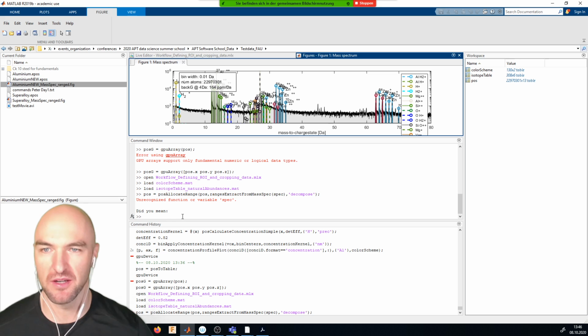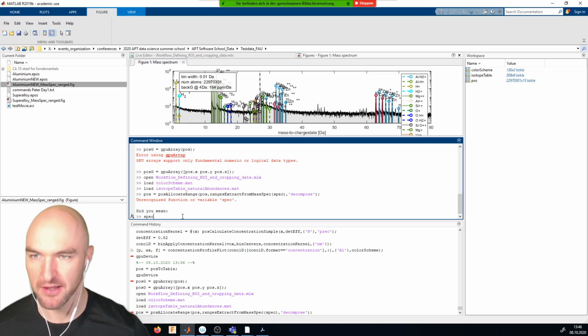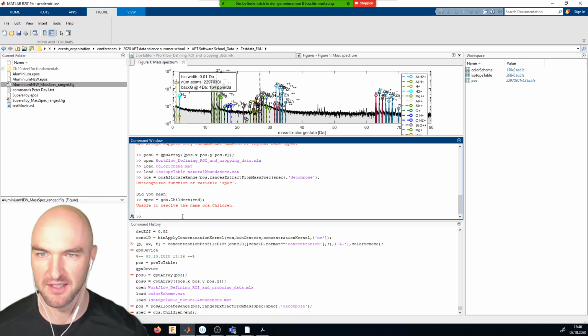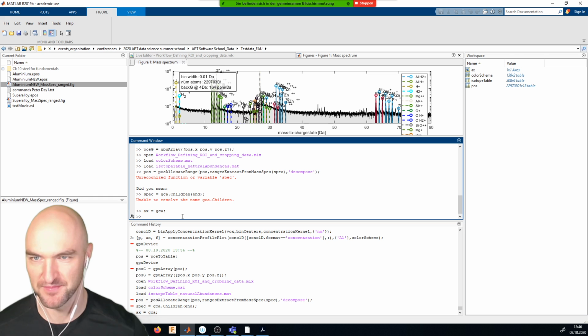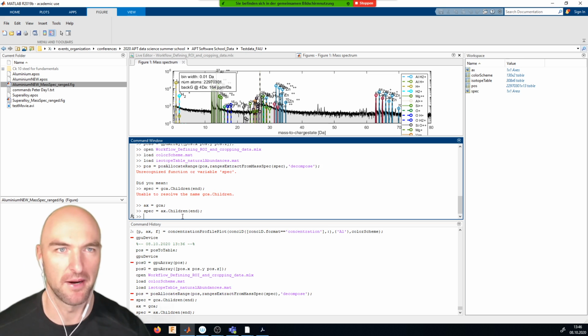Okay, so let's get the spectrum. Can I do it this way? No. Okay. I just like the command line, sorry.